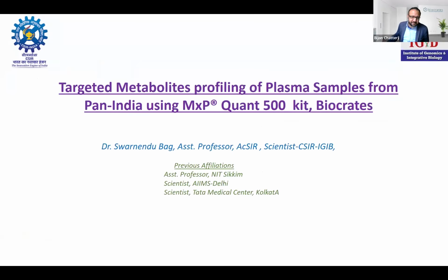So we are using the MxP Quant 500 kits from Biocrates for the absolute quantification of metabolites from plasma samples. So the idea comes from that.